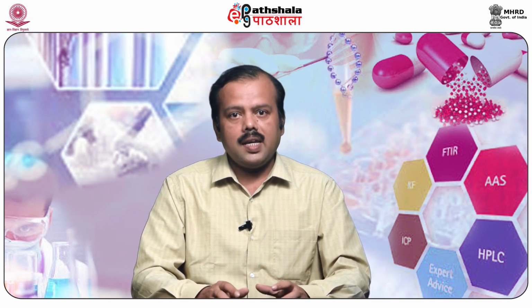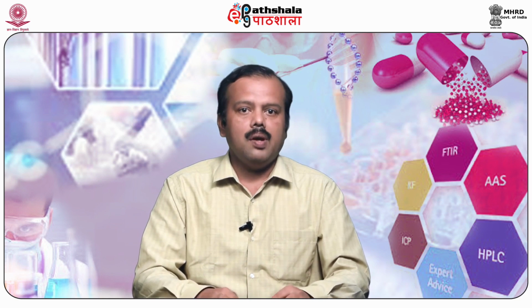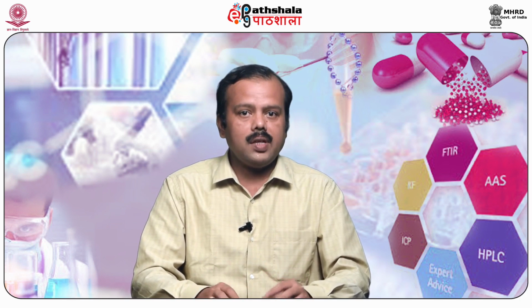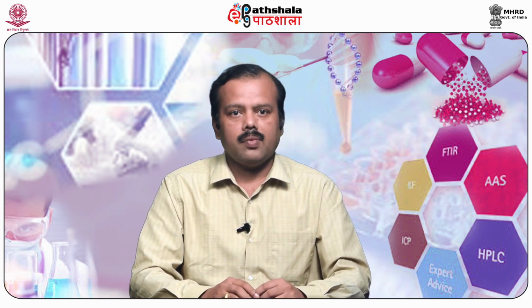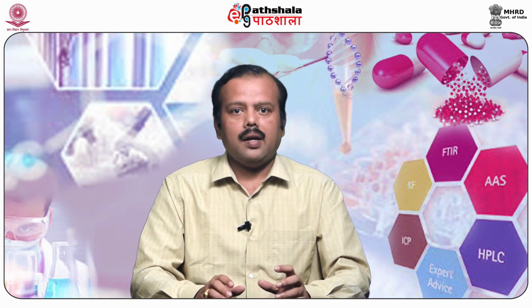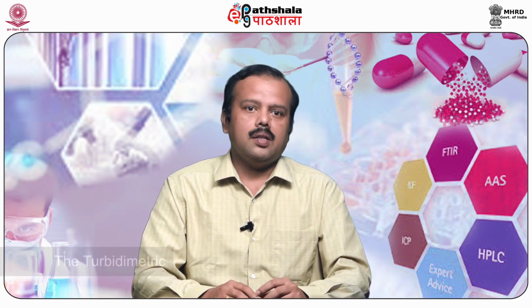The microbiological assay is based upon a comparison of inhibition of growth of microorganism by measured concentration of antibiotics to be examined with that produced by a known concentration of a standard preparation of the antibiotic having known activity. Two general methods are usually employed for antibiotic assay. Number one, the cylinder plate or sometimes called cup plate method, also known as method A, and the second method is the turbidimetric or tube assay method, also called method B.